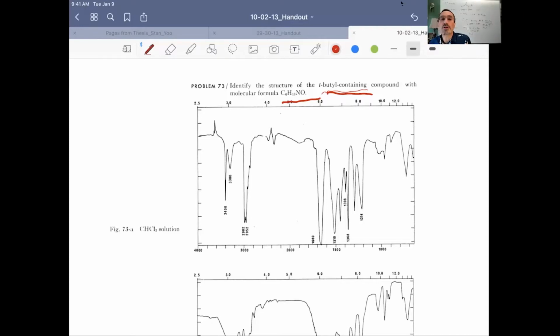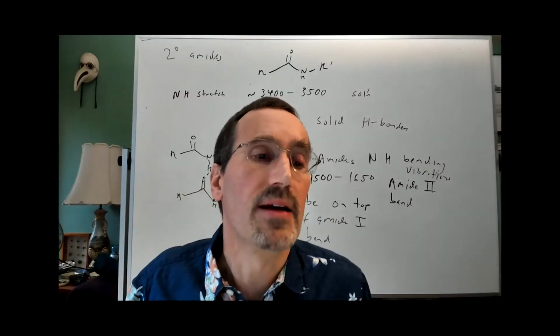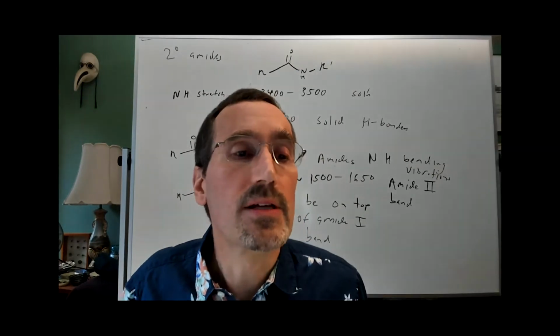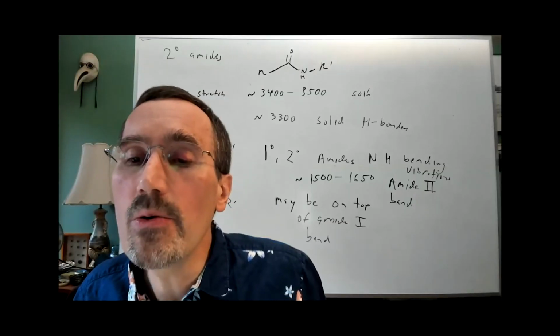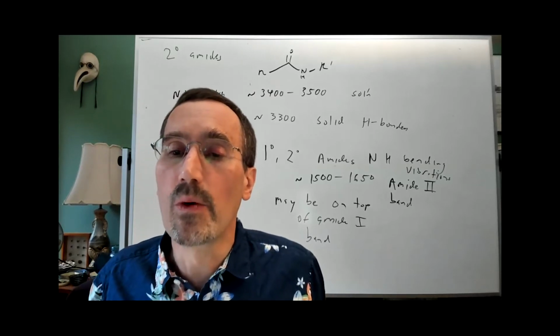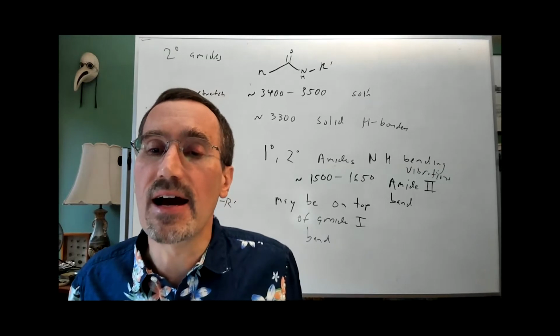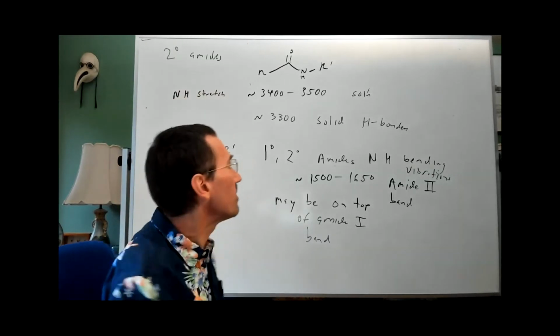Let me stop sharing my screen and then whoever wants to comment. Carissa, was it you who wanted to show something? No. Han. Ah, okay. So what you have here is a primary amide with 1, 2. So it's a 5-carbon chain or 6-carbon chain primary amide. Yes. So let's get that up on the whiteboard here.